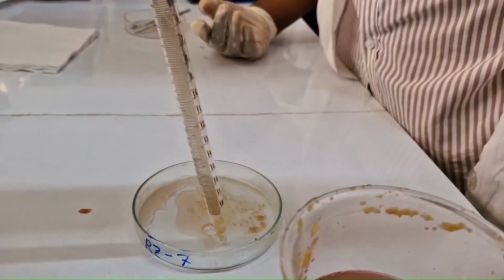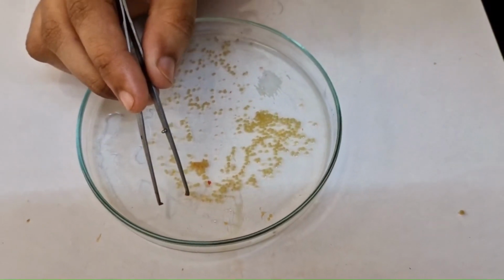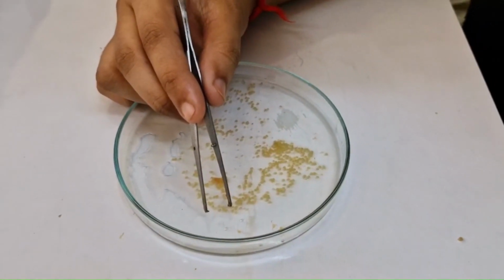We counted the number of eggs in each subsample, subsample 1 and subsample 2, where we found the number of eggs in subsample 1 was 744, which is denoted by N1, and the number of eggs in subsample 2 was 829, which is denoted by N2. By using this data, we estimated the fecundity of fish. You can see the equation in the slide.